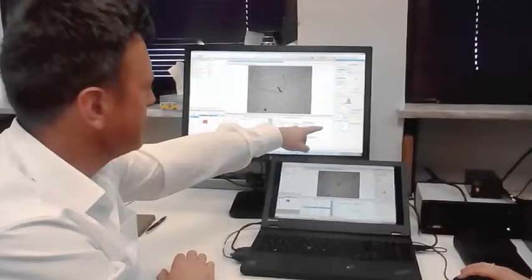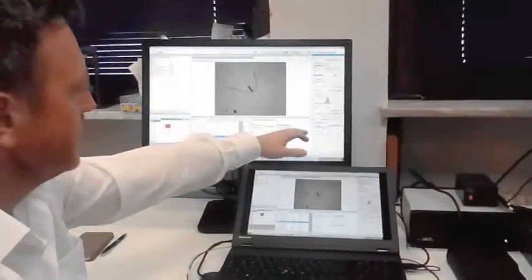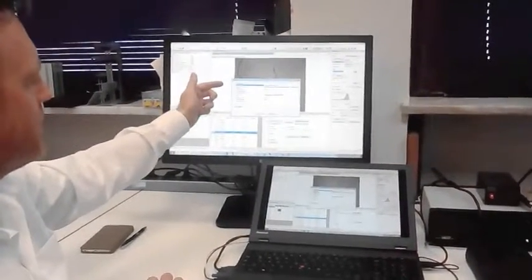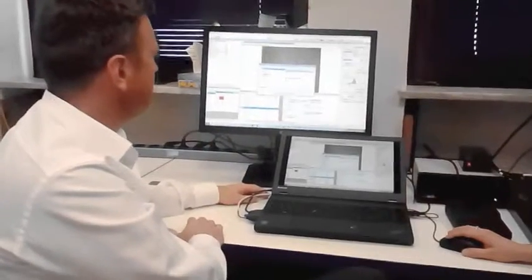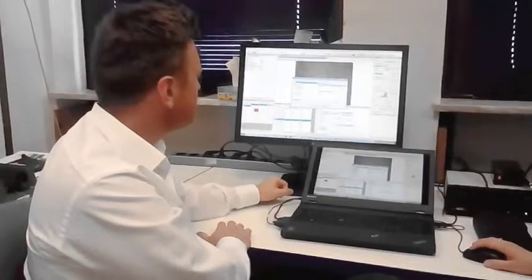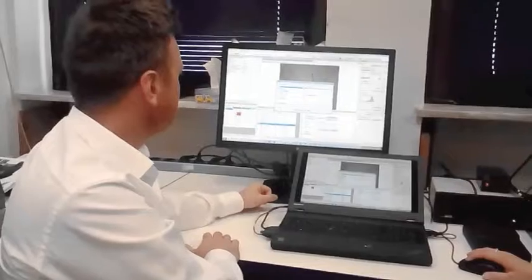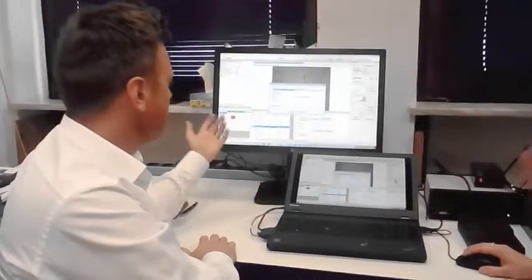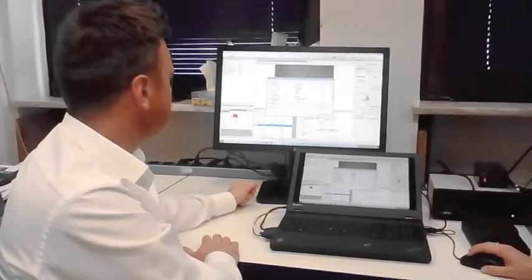So if we drop down this box, we have a number of different things. We can export raw data. We can do all kinds of other things. But an Excel report is by far the most popular. The system as standard comes with a number of templates in here according to the type of layout that you'd like to do. There's a lot to choose from. So I think, do you have that opened? The template layout, yeah. The template is done, the details are done, so the report head, we call it report head. Yeah, so it's ready to go.